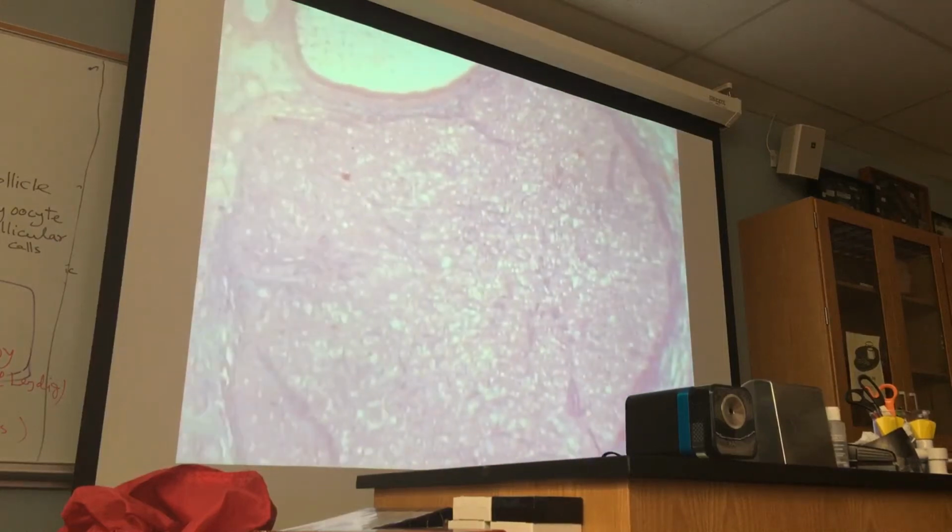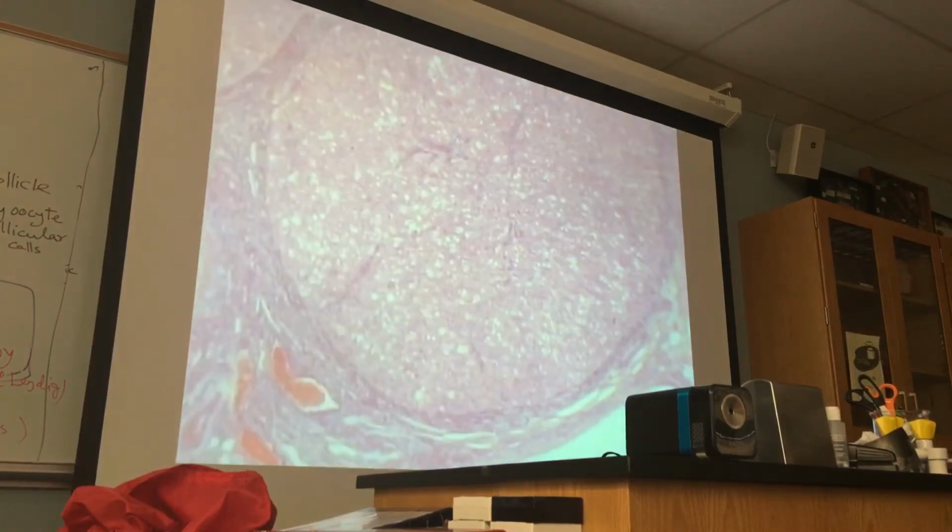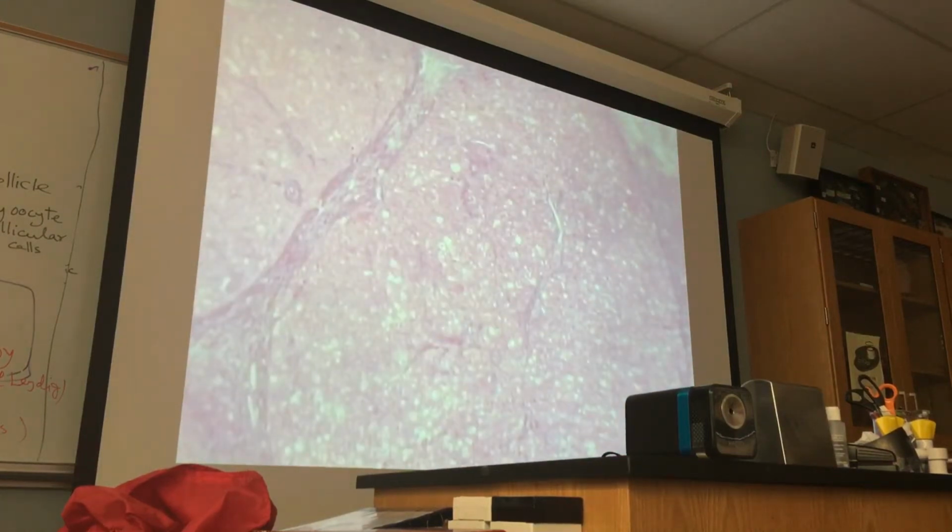Now can you tell me why we find more than one? We find 3 in this ovary. You have to consider that this has come from a cat, and a cat is a multiple breeder. In a litter there are, say, 6 to 8 kittens or 4 to 8 kittens. Each corpus luteum will represent one, isn't it? From one secondary follicle, the corpus luteum results from that ruptured follicle. Okay?